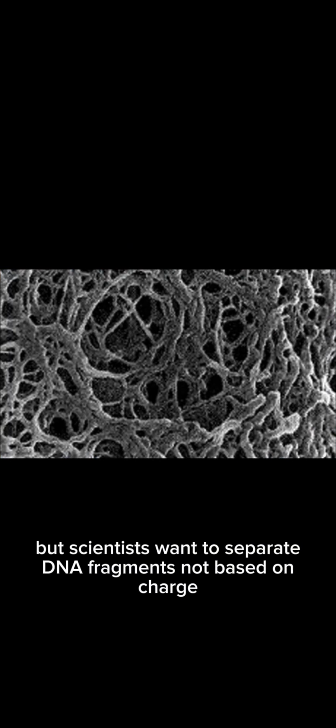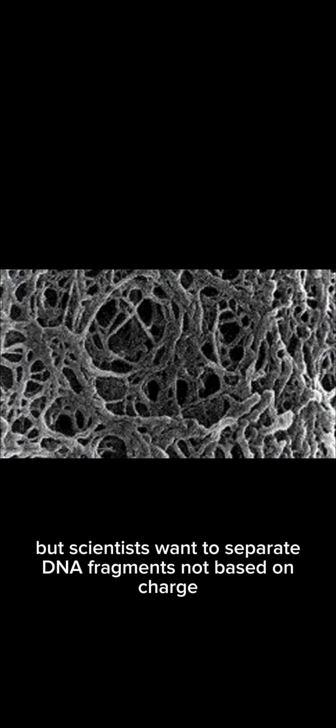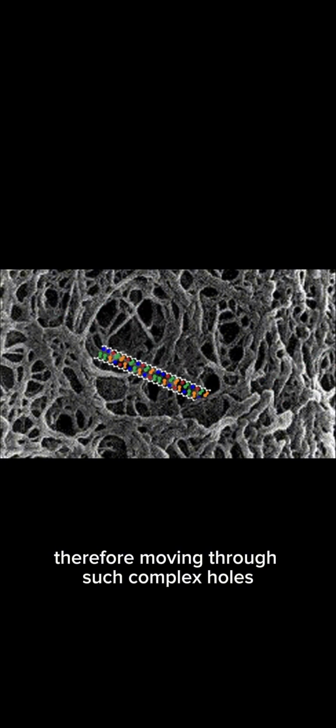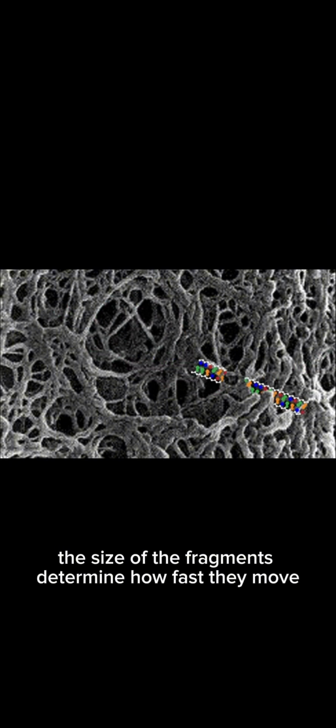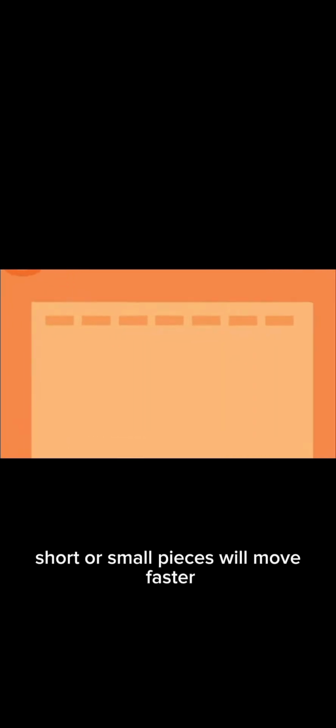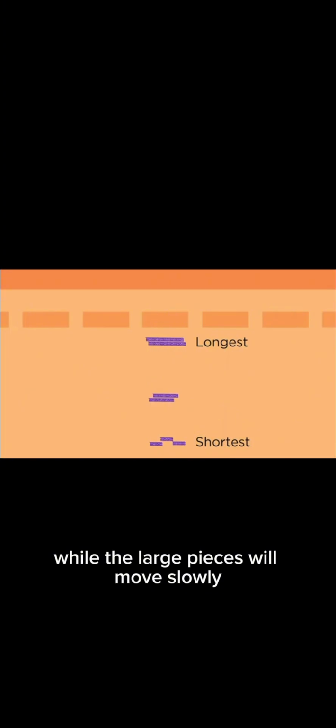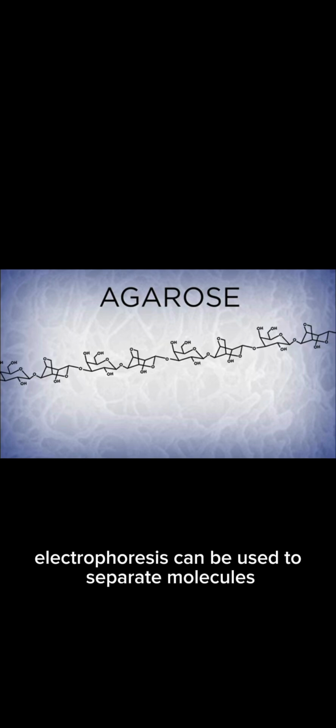But scientists want to separate DNA fragments not based on charge but by size. So they put them into a gel full of irregular holes like a sponge. Therefore, moving through such complex holes, the size of the fragment determines how fast they move. Short or small pieces will move faster, while larger pieces will move slower as they encounter hurdles due to their size. The small pieces will move faster to the opposite side of the gel, while the large pieces will move slowly. Therefore, using this, agarose gel electrophoresis can be used to separate molecules.